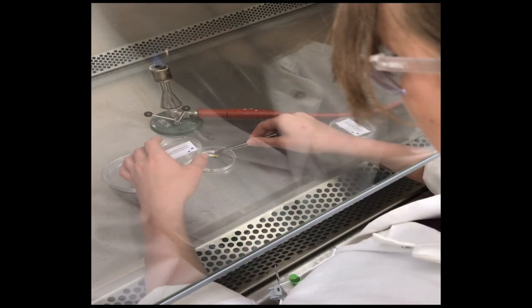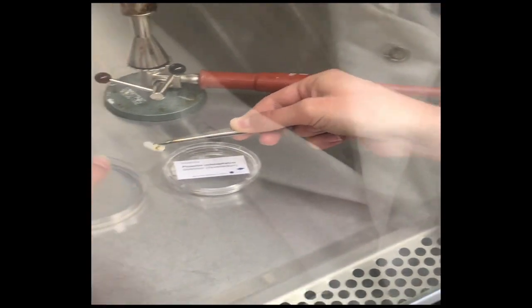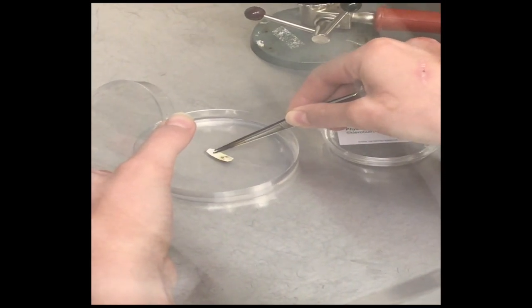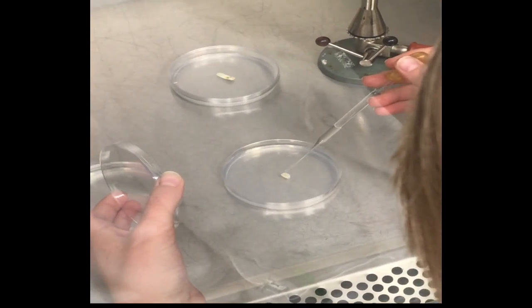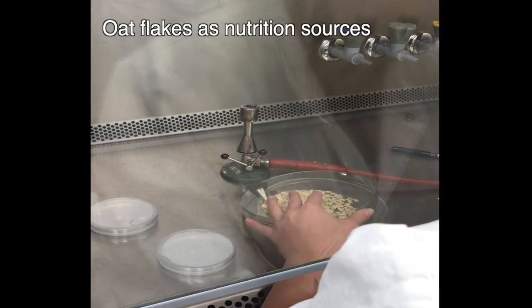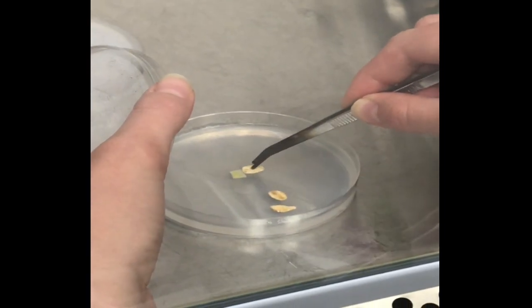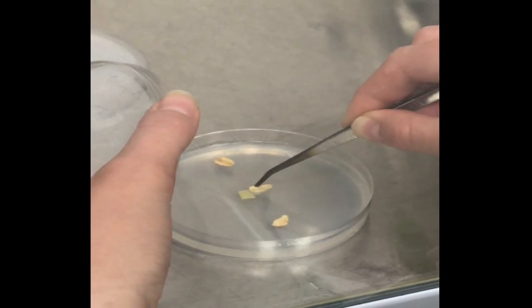To cultivate this slime mold, a piece of filter paper is placed on a 2% agar with the sclerotium upside down. For reactivation, some drops of sterile water are given onto the sclerotium. Afterwards, some sterilized oat flakes are placed directly next to it. The oat flakes are used as a nutrient source because they are cheap, easy to handle, and simple to sterilize.